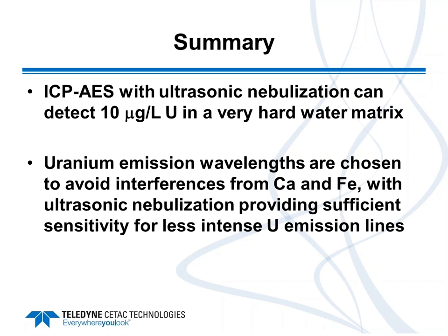But, interesting. Oh, sorry, ICPMS. Yeah. But certainly when I read it, I was like, what's IDP? You certainly, again, can easily interface the ultrasonic nebulizer to an ICPMS. Again, you simply are going to use the nebulizer gas from the host ICPMS to sweep the aerosol to the plasma.